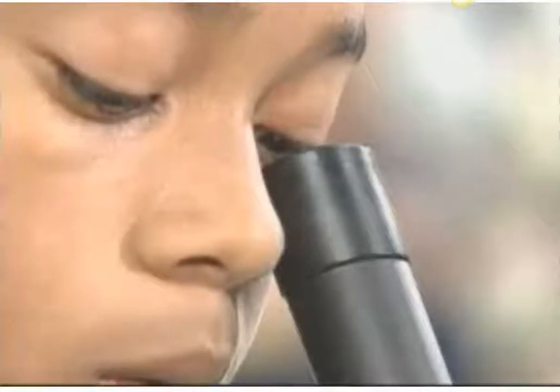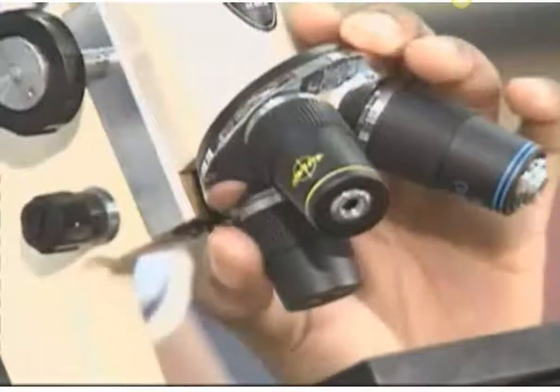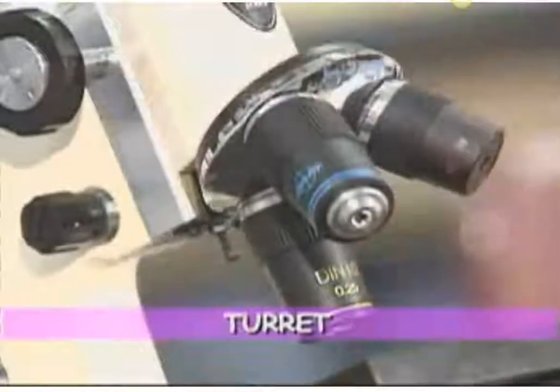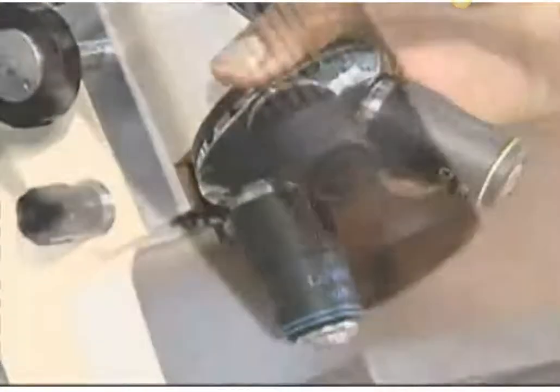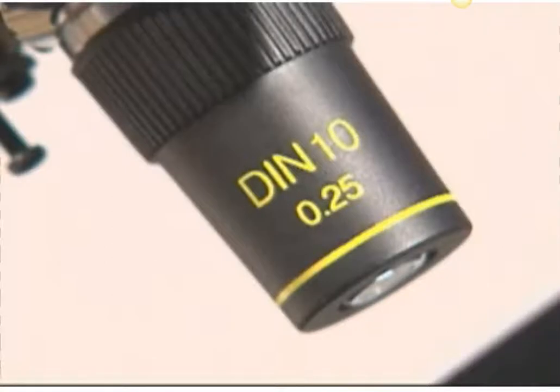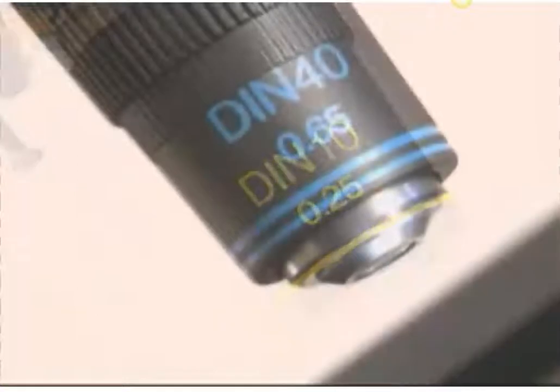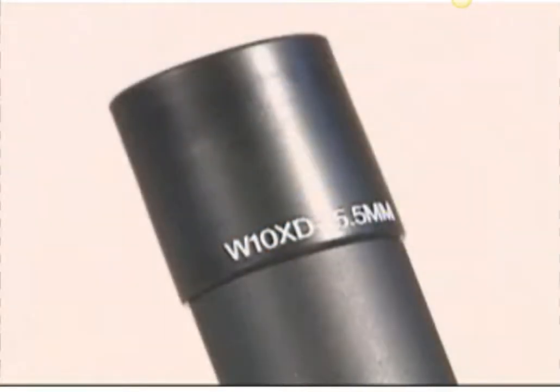Most student light microscopes usually have a single eyepiece lens. The objective lens is usually located on a rotating turret with several other lenses. Multiple objectives provide a variety of magnifications. This objective will magnify an object 4 times. Its power is 4. This objective will magnify an object 10 times. Its power is 10. Finally, this objective will magnify an object 40 times. Its power is 40. The eyepiece of a typical student microscope usually has a magnification of 10.